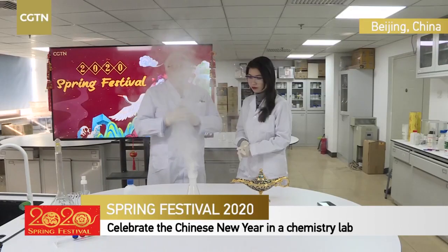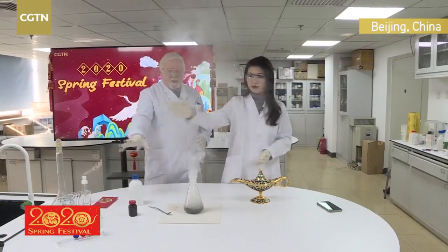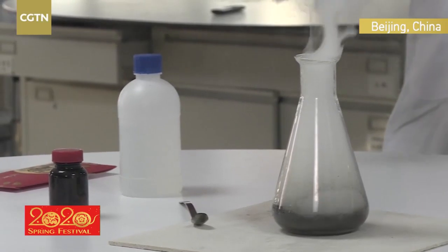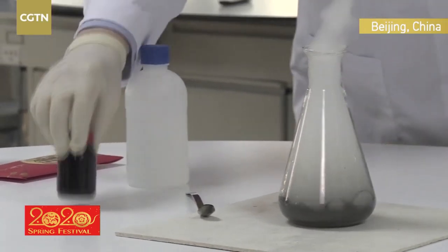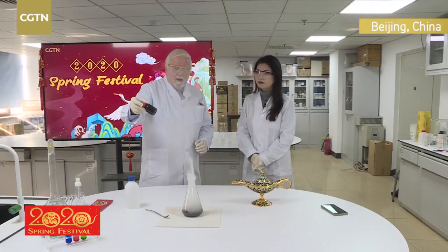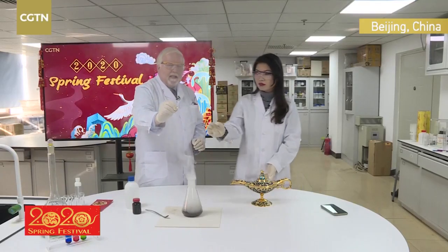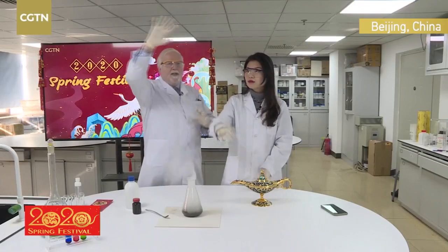So what we did is actually a very simple chemical reaction. The liquid is a solution of hydrogen peroxide in water, H2O2, and it's slowly decomposing into oxygen and water. But to speed things up, because your audience didn't want to sit around for a few days watching it slowly decompose, we added a little bit of a catalyst, manganese dioxide. If you were watching closely, maybe you saw I had a tea bag containing the manganese dioxide. Put it in, and the reaction happens really fast.